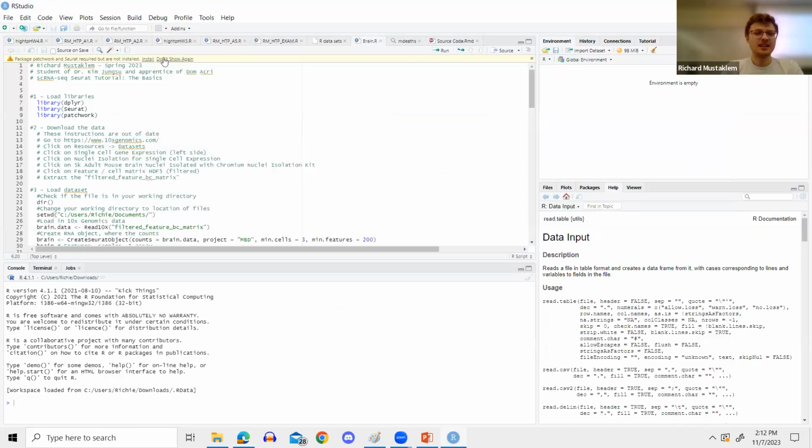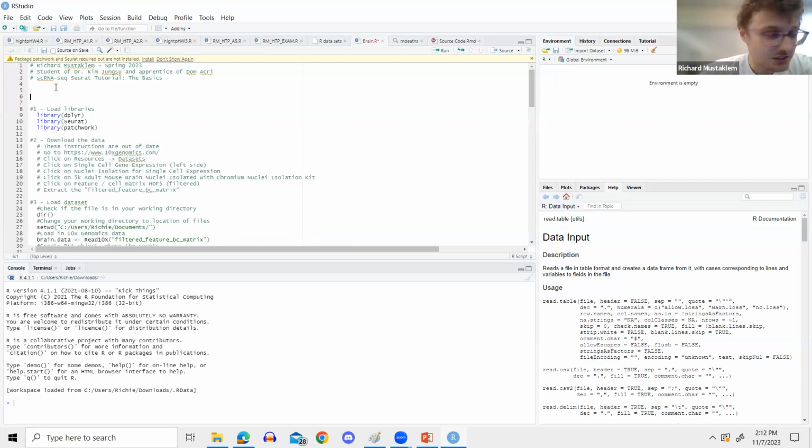So, oh, see, look, I've got to install some packages. So first and foremost, we need to make sure we have these packages installed. Can we all see on Zoom as well? We can see this. So install.packages, make sure you guys have these as well. Sorry, there needs to be an S here, but I think I have dplyr as well, but let's do patchwork.